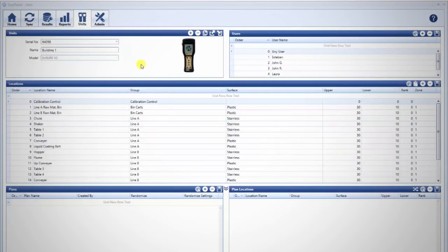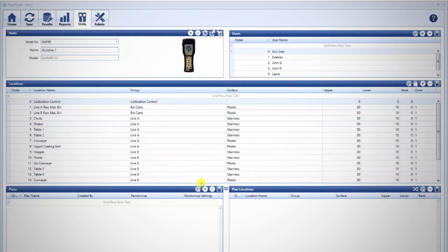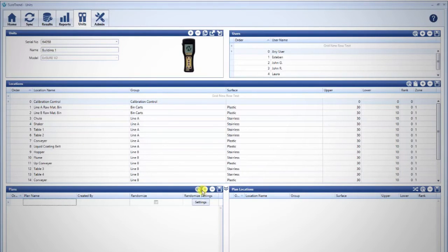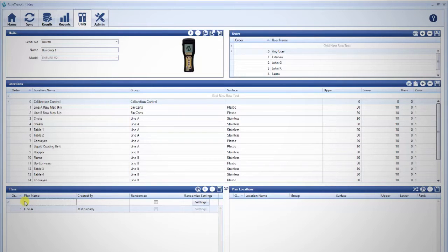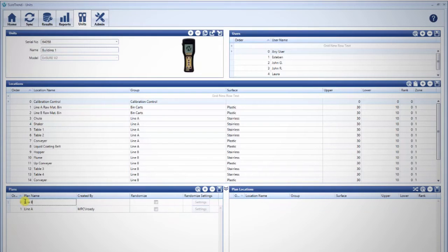To make a test plan, navigate to the units tab and click the plus sign in the plans pane. Name the plan and once completed press enter. Hygiena luminometers display up to 20 characters for the plan name. You may also click into the empty box under plan name and start typing, then press enter when finished.